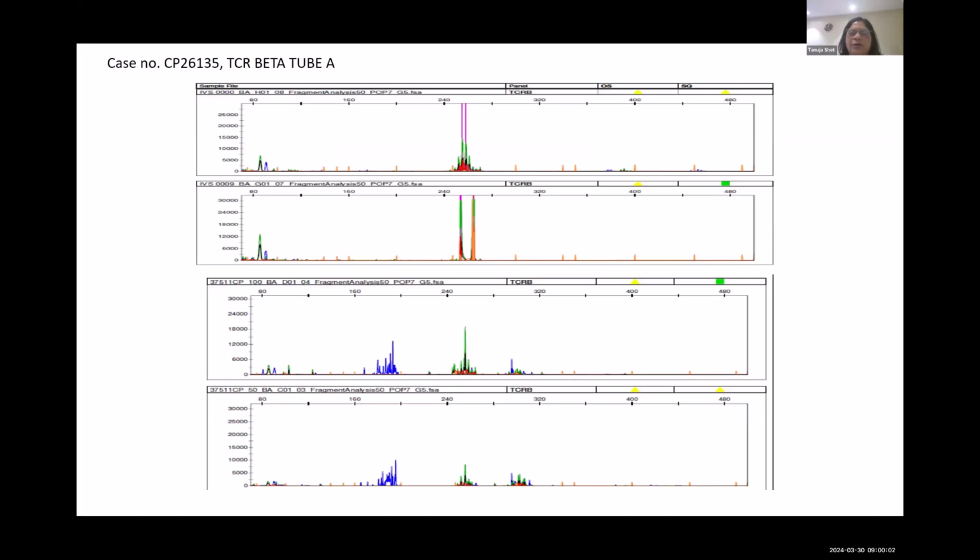And the next photograph you see is of the capillary electrophoresis, and you can see that that's a positive control. And in the same area, you can see that the tumor cells are showing the TCR beta gene is showing a clonal population of cells. So if you see this kind of a peak, that's polyclonal. If you see one peak standing out of the rest, this is clonal in a polyclonal background. So this is positive for T cell clonality.